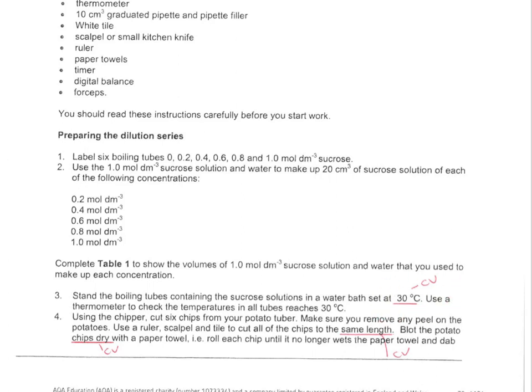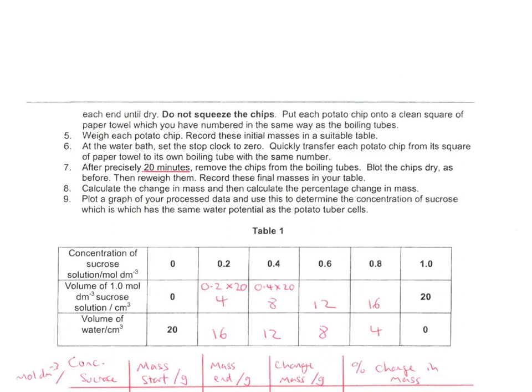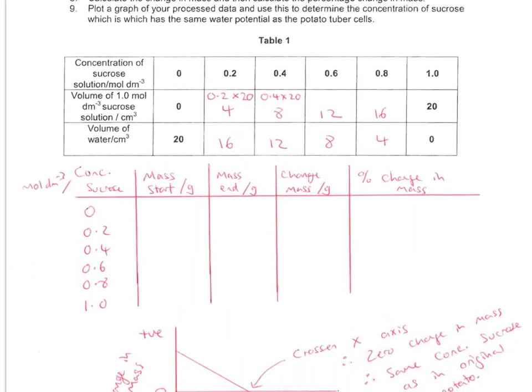Again, another control variable allows comparison, because if the tubes were at different temperatures, it would affect the rate of osmosis, because osmosis is temperature dependent. Again, other control variables: the potatoes have to be the same length, and you have to let the chips dry, so two more control variables there. And another control variable here: you've got to leave the chips for 20 minutes in the boiling tubes before you record the final mass.